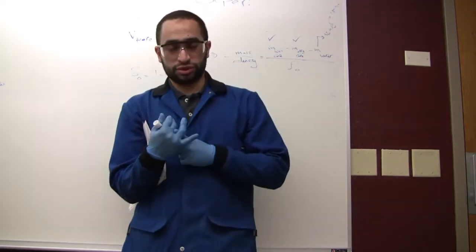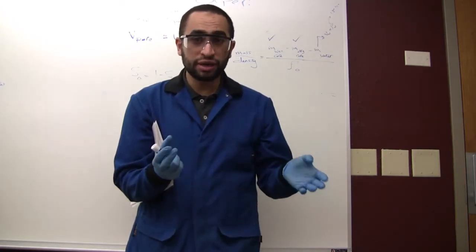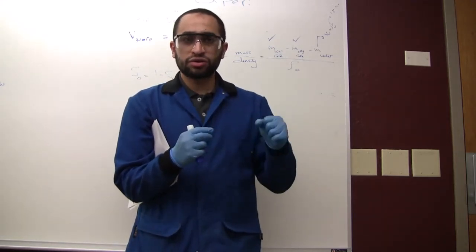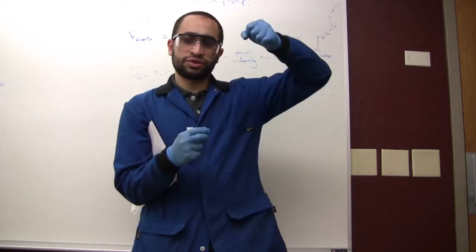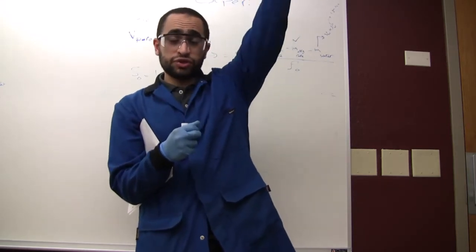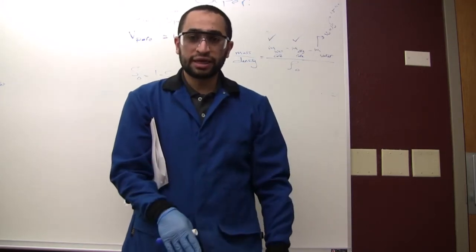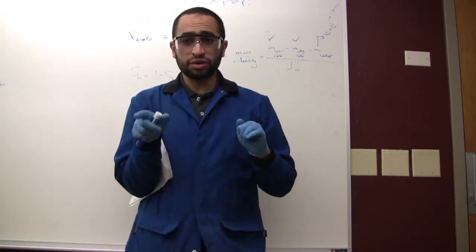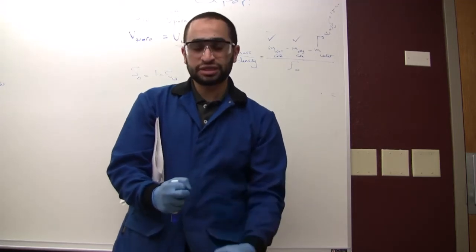oil and water. So usually the boiling temperature of toluene is higher than water, so when it goes around the core, it causes the water to evaporate as well. And then both the water and the toluene go up to a condenser that has a very low temperature, and this condenser causes both of them to condense and drop back around the core, and then with siphon effect, water and toluene go back into some kind of graduated cylinder.